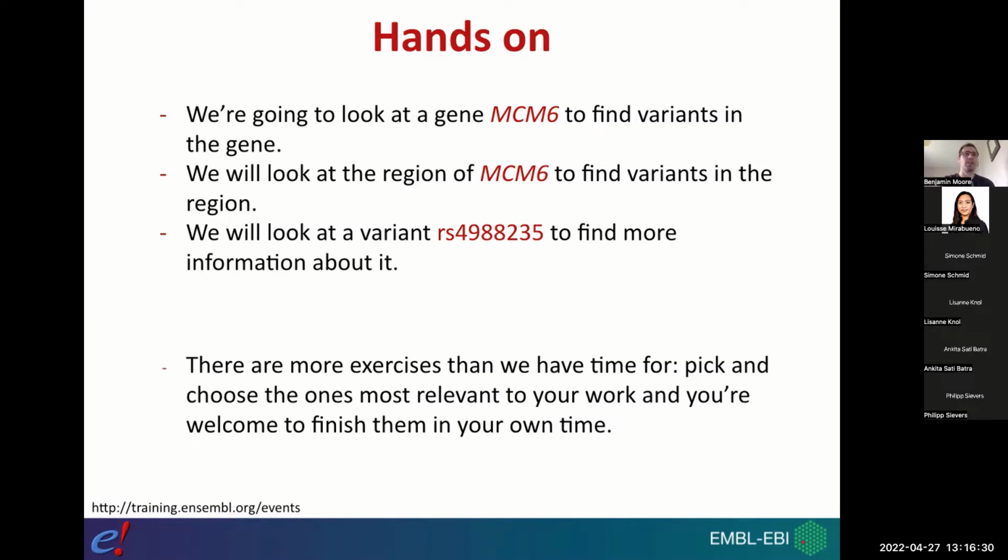So maybe I'm not sure exactly of the specifics of what you've been looking at. So maybe if you, in the living document, if you could put some links to the pages that you're looking at and the IDs of the variants that you've identified where they're sort of maybe overlapping, then we can look into that in a bit more detail. But I'm sure there's a reasonable explanation, but I don't know it without looking. So yeah, put it in the living document, and Louise and I will take a look later on after the VEP section.